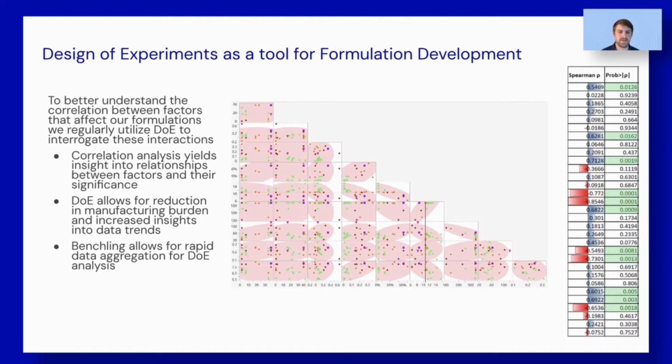Statistical analysis of these factors yields correlation results and significance probabilities. See the table to the right. The color of the bar represents a negative or positive correlation, so negative in red and positive in blue. The size of the bar represents the slope of the correlation fit.